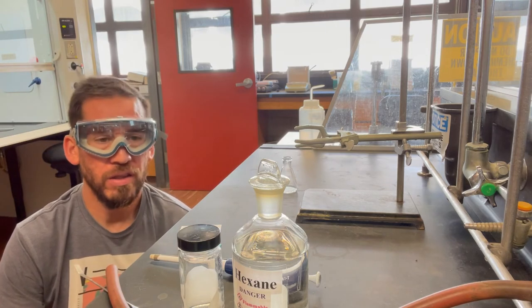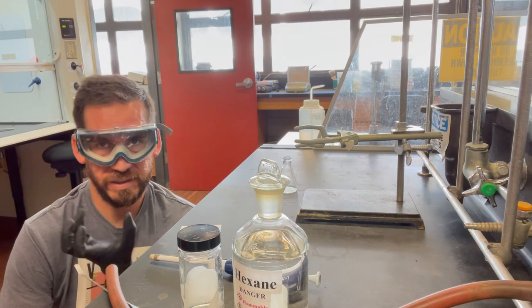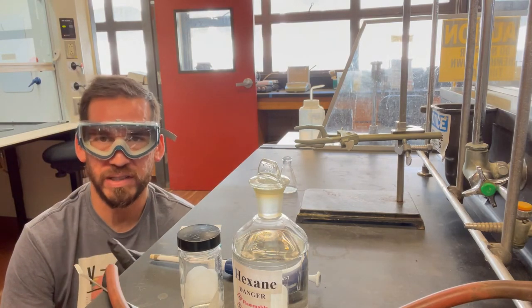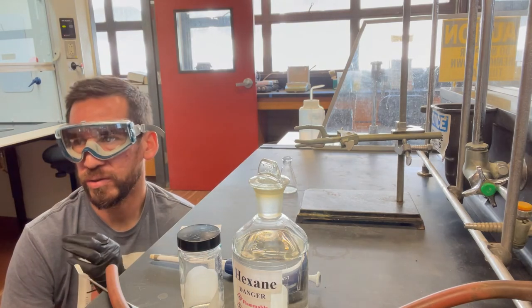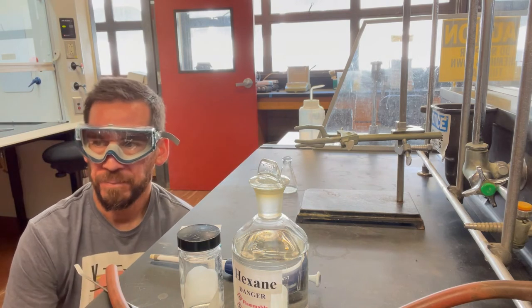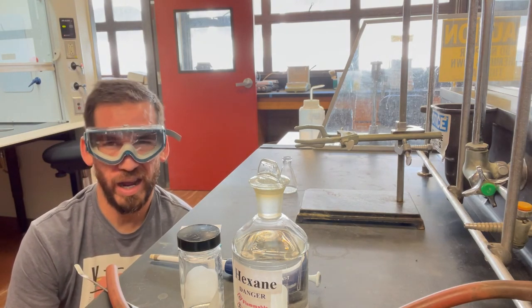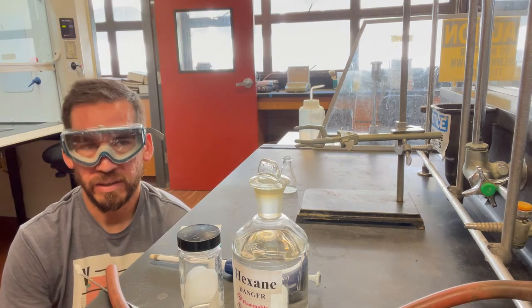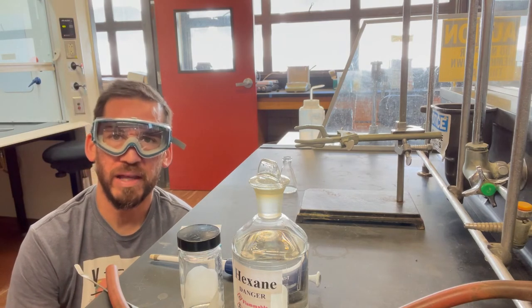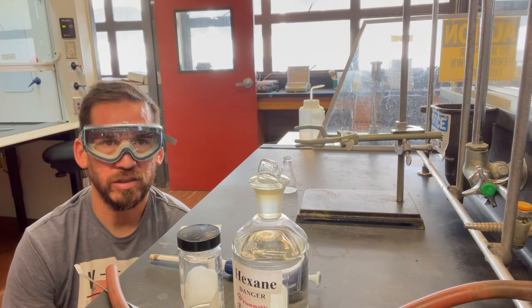So what we're gonna do is throw that back on the vacuum. It's still on the Buechner funnel, so we're gonna wash that with a little bit of water to get rid of the salt. I'll do three 1-milliliter portions on each of those solid materials. And then I'm going to let that dry for 10 minutes, or 5 minutes on the vacuum. I might even throw it in the oven for a hot second just to get it extra dry.